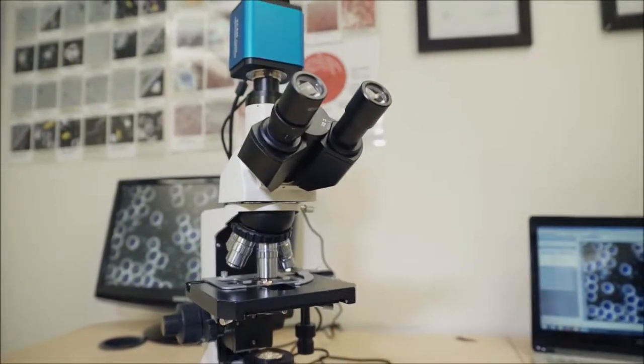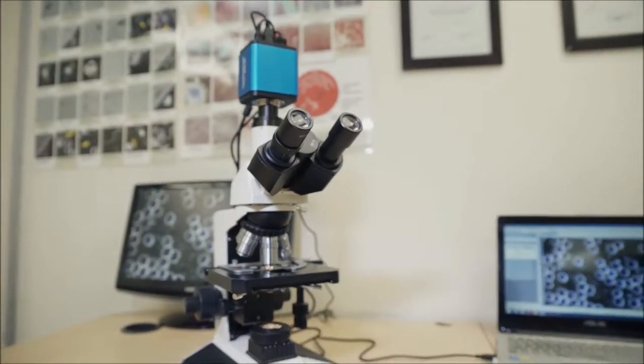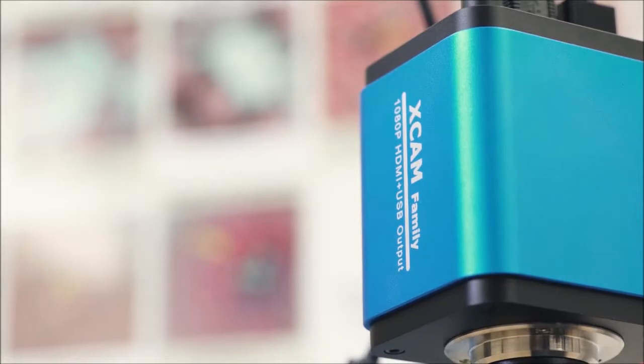We are looking at the HDMI LED model today. The assembly for the entry-level system will be essentially the same, the only real difference would be the camera. Very important to mention with the assembly and unpacking of the microscope is just to ensure that no dust gets into any parts or components of the microscope, and we'll be looking at that in more detail when we start assembling the system.